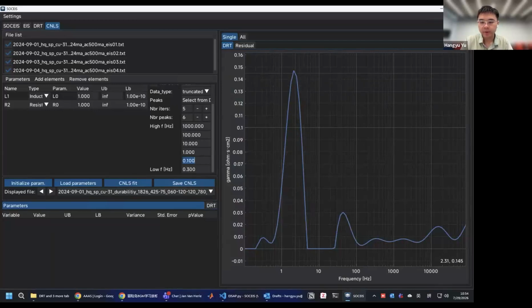And then the second peak, which is 2.31. This peak, put across here, is 43. And this peak we have 330-ish. This peak we have 1,800, and this peak we have around 10,000 or 15,000. Okay. Now we have 6 peaks.